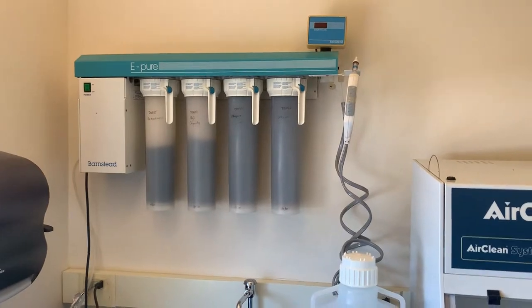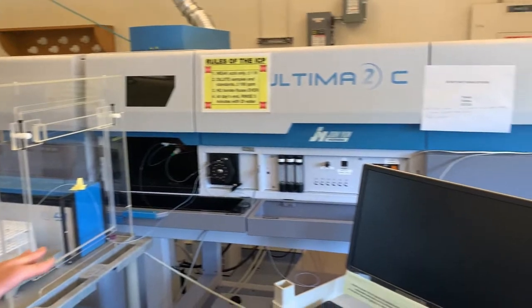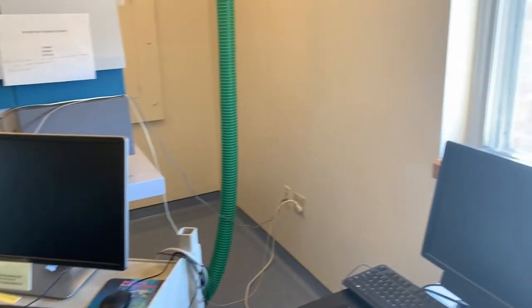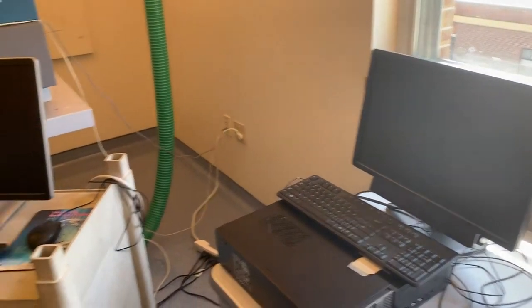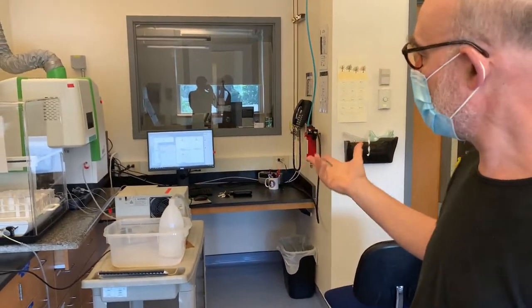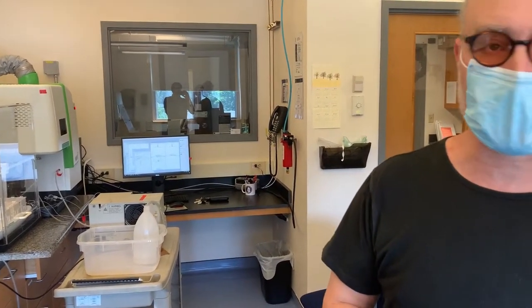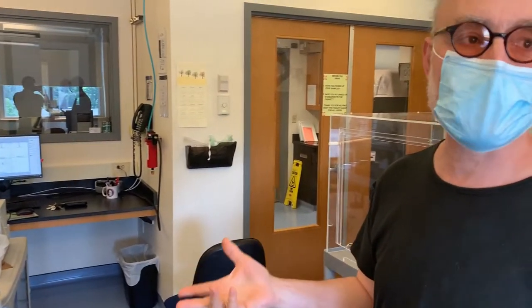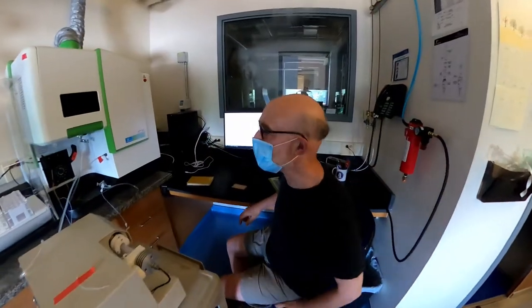And then we have various computers that collect data about coming from each of these various machines. And when your samples come to us, Nico will be responsible primarily for doing the XRF work that you'll see in the video. And I'm going to be responsible primarily for doing the ICP work. But we both do these kinds of work together. And these are fundamental ways with an XRF and an ICP of understanding the chemistry of waters and of solids like rocks that we have around us and soils.